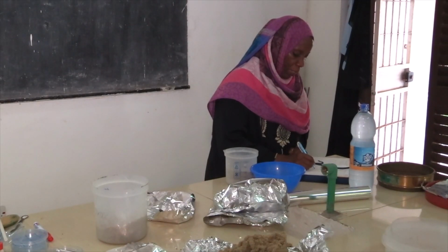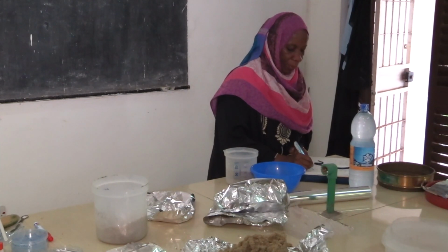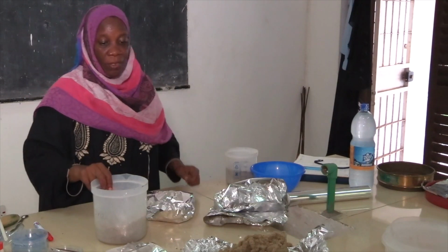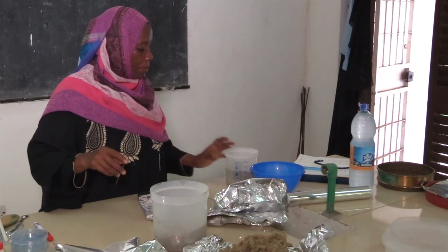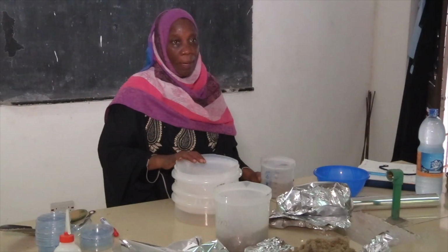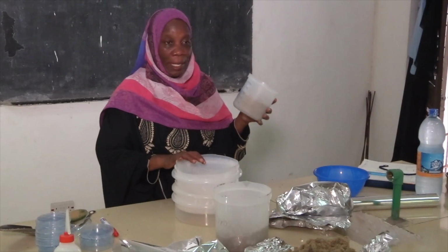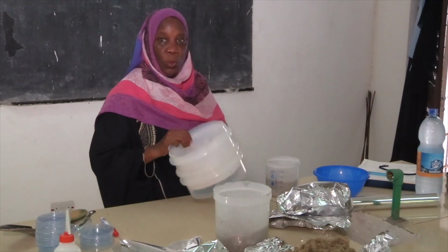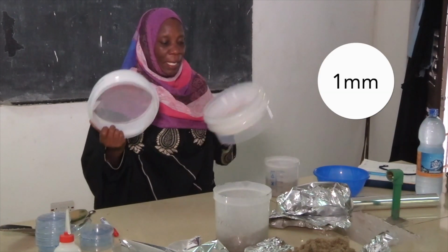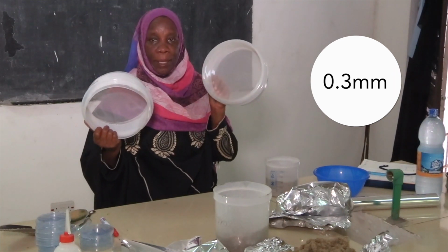We have 4.43 kg. Now our rest replicate is 4.4 kg, all of this, but this one is only 1 kg. In the first replicate, the 1 kg replicate, we use 2 types of sieve. This one is 1 millimeter, and this one is 0.3 millimeter.